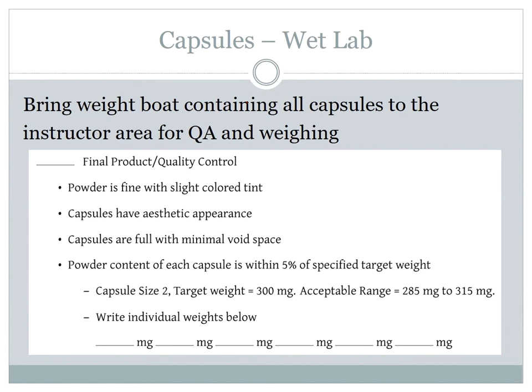Today, we're going to do it the same way we're going to do it on the exam. You'll be with us and you will see and watch us weigh each one of your capsules individually. If any of them are outside of the range, you would lose the credit. So let's just talk about the range. For 300 milligrams, it's as low as 285 and as high as 315. Trust me, because our scales aren't going to be exactly the same, you should really stick between 290 and 310. If you give me about 5 milligrams of leeway, that means you keep yourself within 290 and 310, I'll give you 285 to 315. There's usually no problem with the weights of your capsules. Just a thought in terms of your compound, okay?